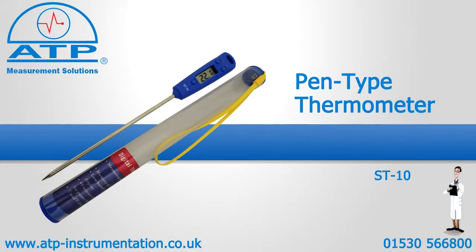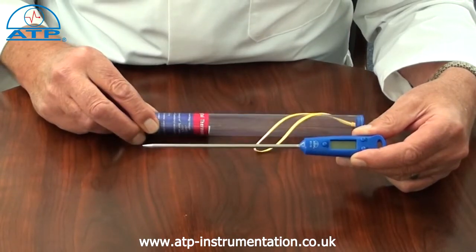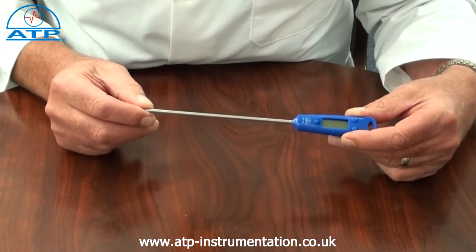An introduction to the Pentai thermometer. It is supplied with a storage tube and battery. This instrument is ideal for temperature monitoring of liquid and semi-solid items such as food.